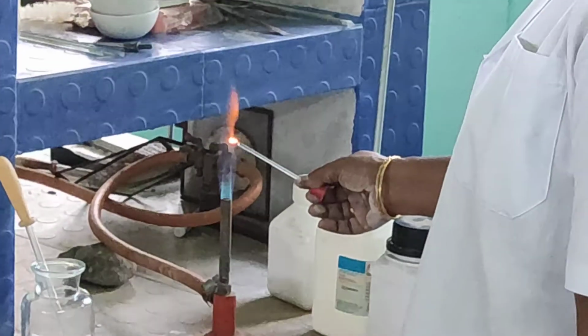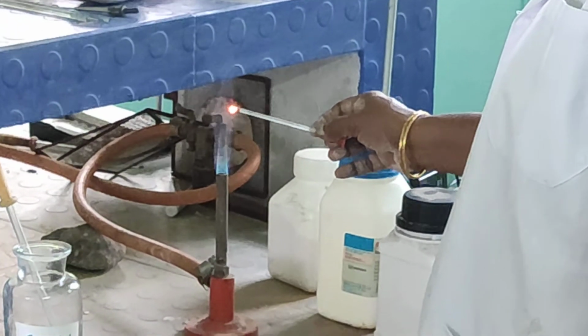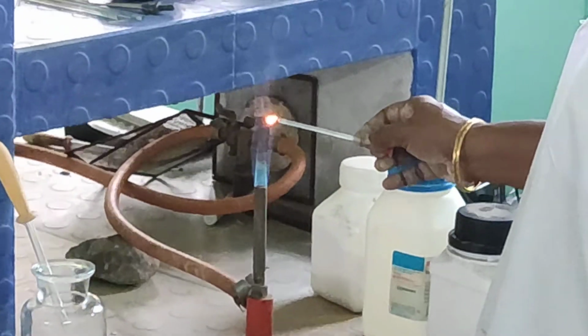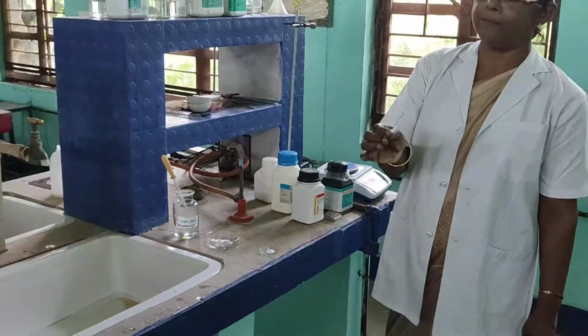Now it is having some color. I have to wait till all the color disappears from the flame. Now the flame is not showing any color, so my platinum wire is clean.